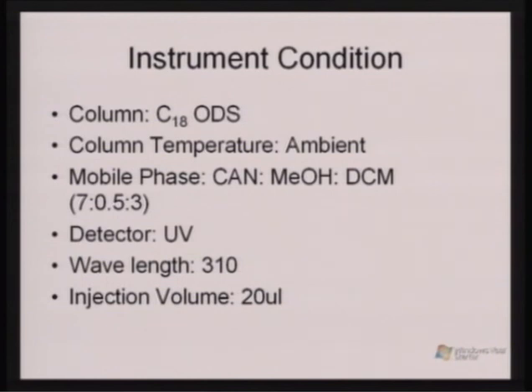After setting all these conditions, run the mobile phase for half an hour so that the instrument and column get conditioned.